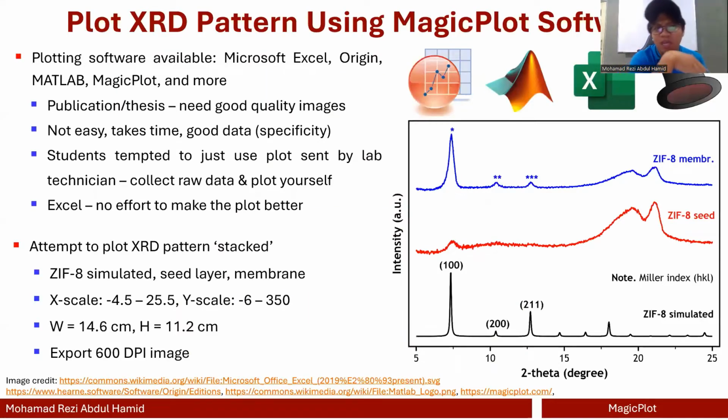But before that, I just want to mention that there are a lot of other available software that can be used to plot a nice figure. You can use Excel, but personally, I don't really like to use Excel anymore to plot my figures, because it's too, I don't know how to say this, but it's too Excel, if you know what I mean. And then you can also use MATLAB, Origin, MagicPlot, and there are a lot more software that can be used.